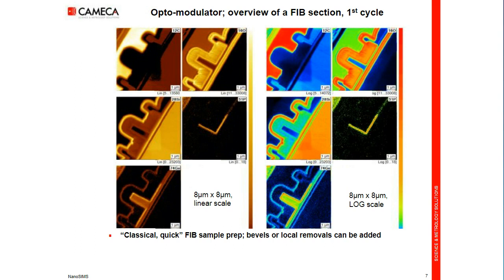So what we observe is that we can image in parallel major elements like oxygen, germanium, together with dopant, despite the fact that on phosphorus it's not so easy. Phosphorus 31 has an interference from silicon 30H. So here the NanoSIMS works at high mass resolving power and resolves this interference without problem, keeping the good transmission. That's the key point.